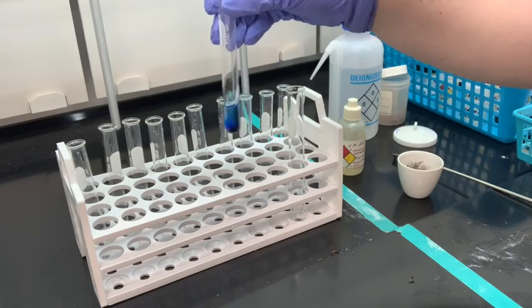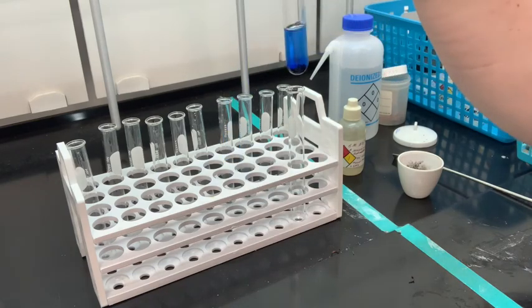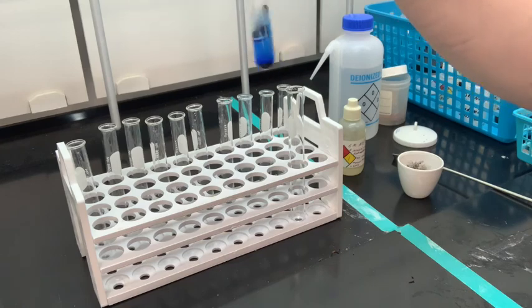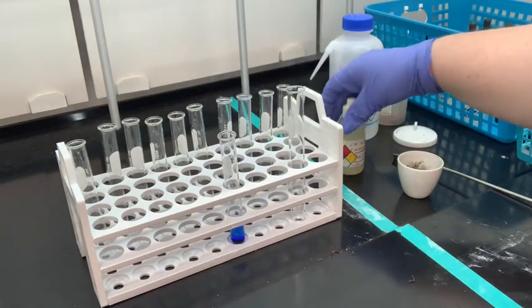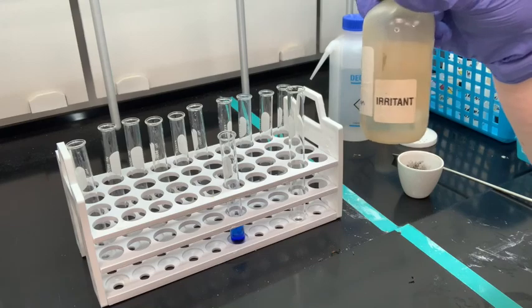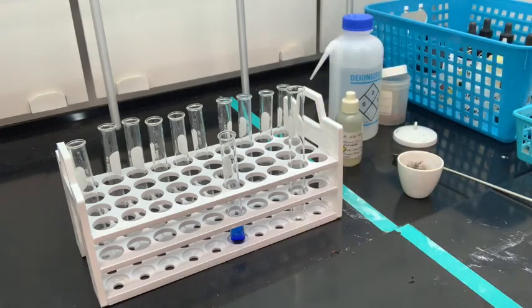You see that when I added it, it's definitely turning blue. We had that blackish, brownish, solid stuff at the bottom. Now we have a blue solution. And you can tell that our ammonia was not blue. It's clear. It's colorless in our little dropper bottle.